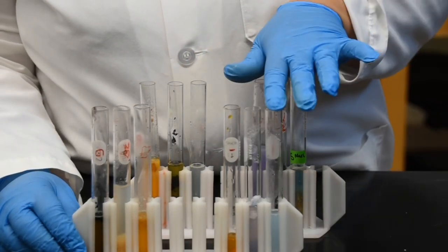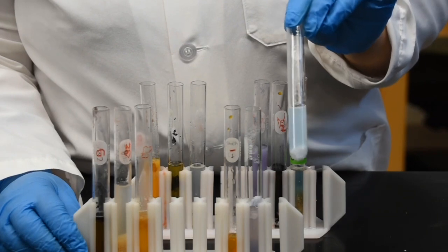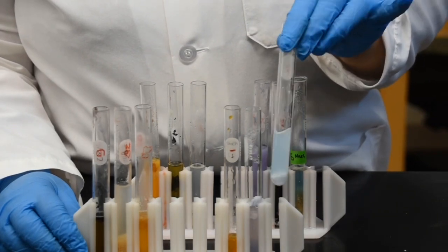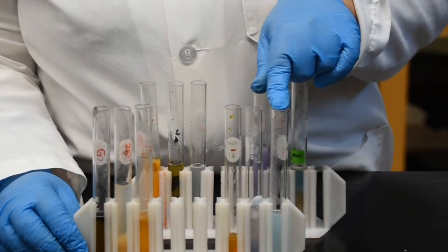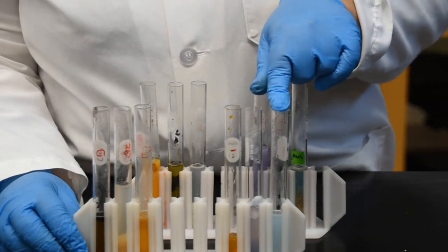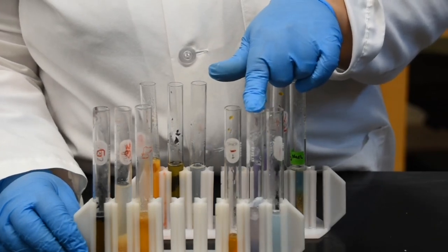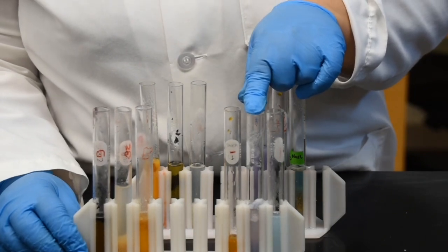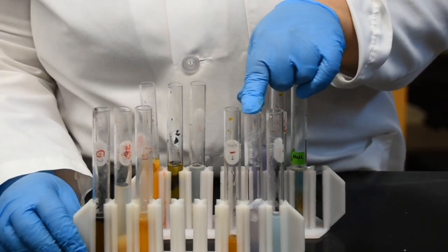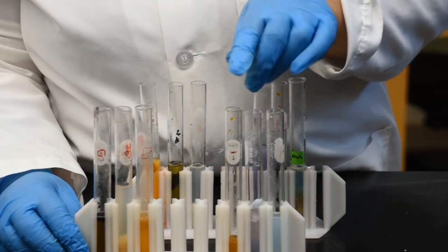So to just kind of give you a hint as far as how you do this, going back to our first sample for the egg, right here you recorded blue color on the first table for the Benedict. So when I go to the second table, I would write a negative for this one because the color change was absent. For the protein sample, I recorded the purple color, so I would put a plus sign because that's a color change indicating my sample was positive for proteins.